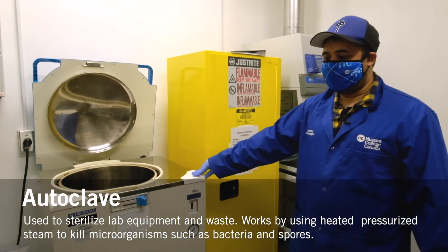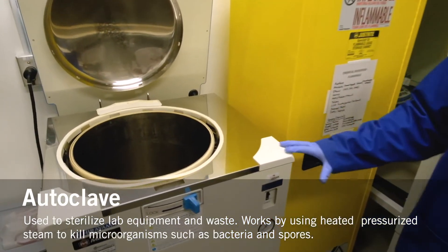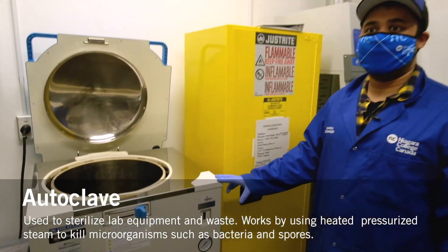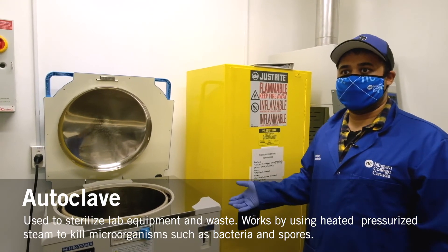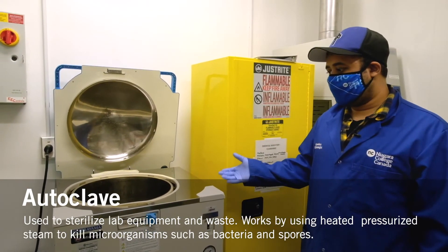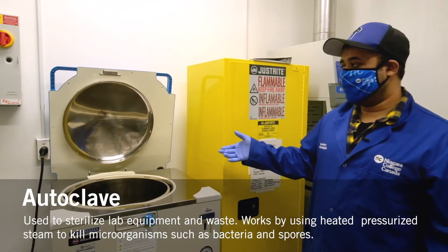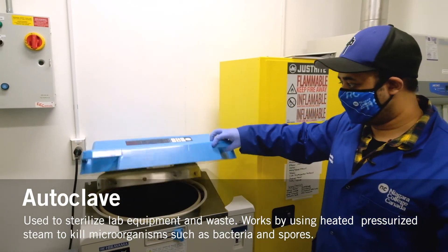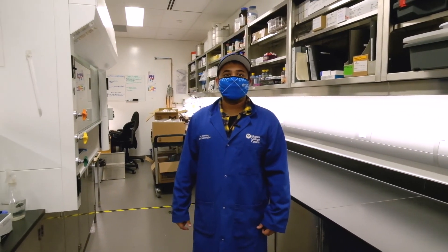So this is the autoclave. Any kind of lab that works with microorganisms should always have an autoclave in their laboratory. This ensures that all the microorganisms they work with are sterilized and can be killed off without exposing a hazard to anyone. How an autoclave works is that it uses pressure and steam to sterilize and kill any kind of cultures or organisms you'd like to sterilize. Any kind of biohazardous waste — you use an autoclave to sterilize and neutralize it. Thanks for the tour — look forward to seeing you in the fall. My name is Roy, goodbye.